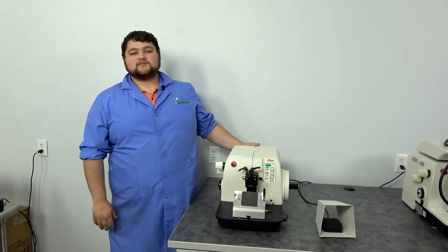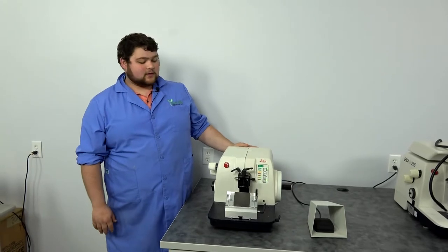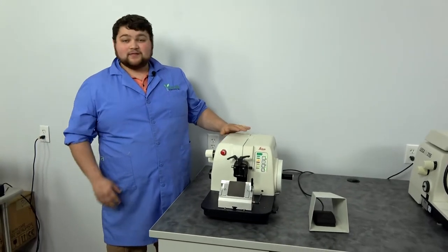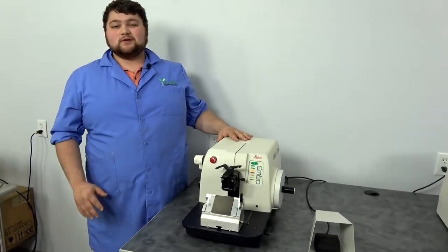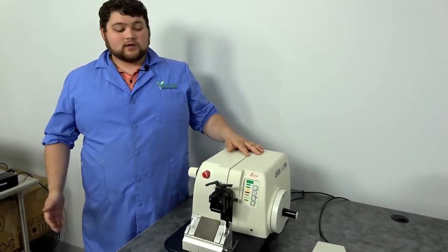Hi, this is Robert with New Life Scientific here to talk about the 2155 by Leica. One of the great things about this microtome in particular is that it is made by Leica. They are very well known for their reliability and longevity.